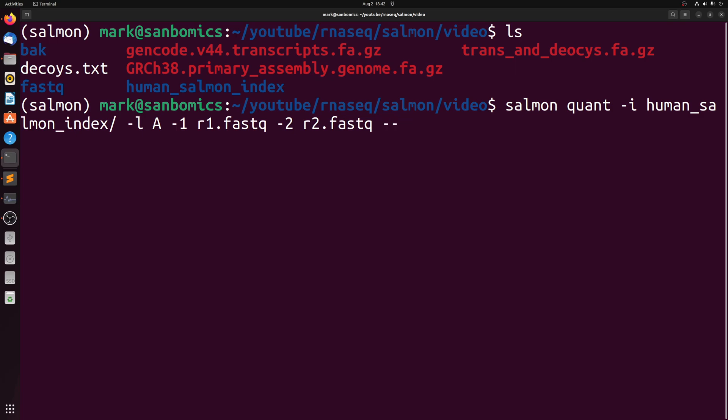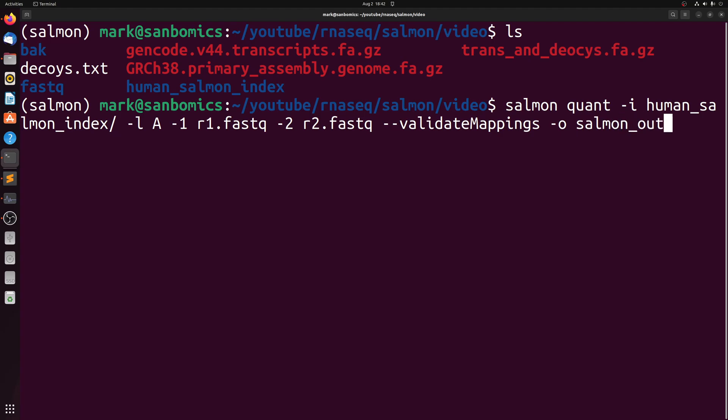And then we want to pass validate mappings, and then dash O is going to be the output path. So we're going to make a new directory that the output is going to go into, and that's going to be called salmon out.